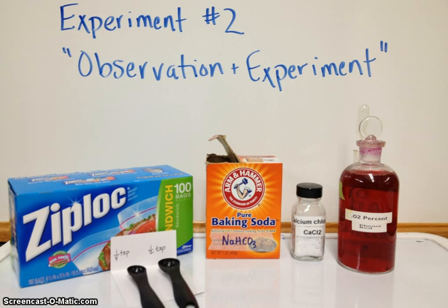The three substances that are used in this experiment are all common chemicals. Sodium bicarbonate, or baking soda, is used as a food additive in baking. It is also used as a natural deodorant to absorb and remove odor-causing chemicals in refrigerators and carpets. Calcium chloride, road salt, is a salt-like compound that is used as a de-icer for sidewalks and roads. Phenol red is a naturally occurring dye that is used as an indicator. It changes color under different conditions.